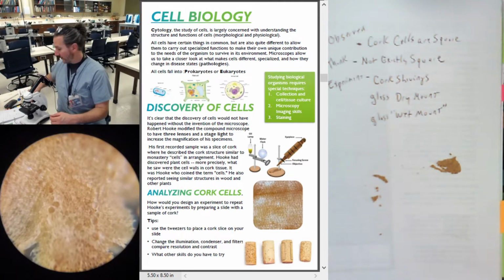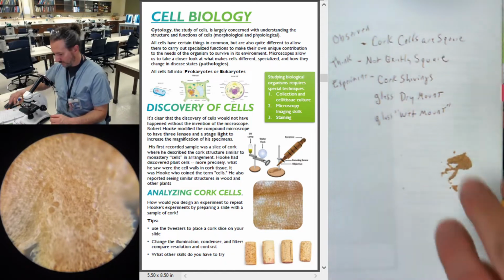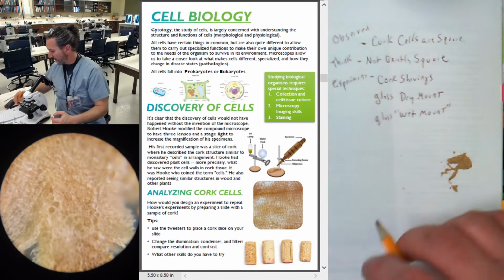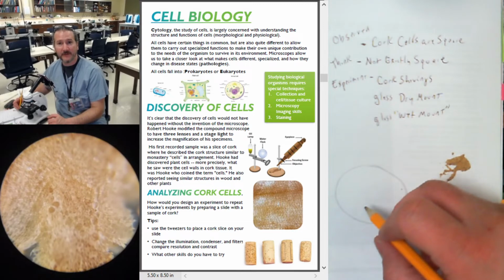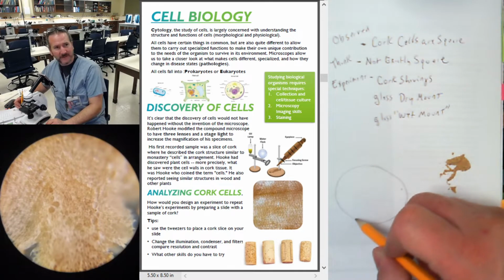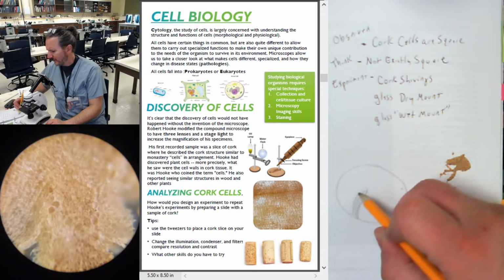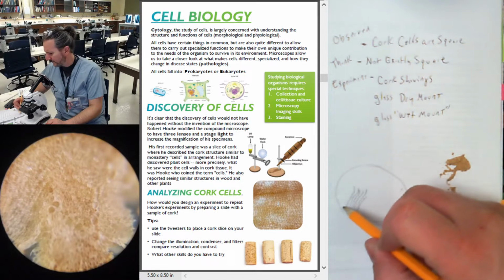So, what I'm going to do, I'm going to brush this out of the way, grab my pencil, and I'm looking at yellow objective, that's 10. Doesn't have to be perfect, but remember I kind of curled the cork as I went along, so if you notice I have kind of like a swirly pattern coming up here.